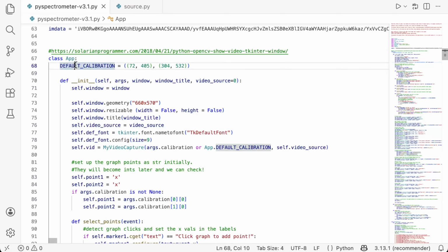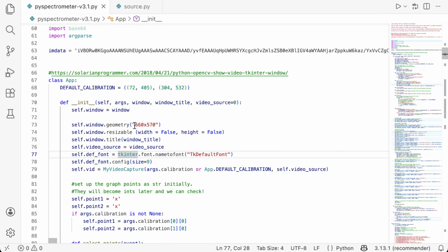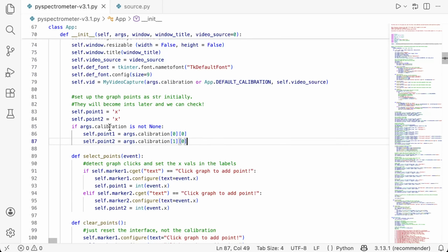The first line of code is a calibration, but we will do it as the last step when everything else is done. As we can see, for the user interface, the Tkinter library is used, which is okay. This library works well. Viewers who wish can adjust the screen size and improve it, but I will keep it as is, it's not critical. Interestingly, the calibration can be used as a command line parameter, so we can use it with different spectrometers, but I am using only one.